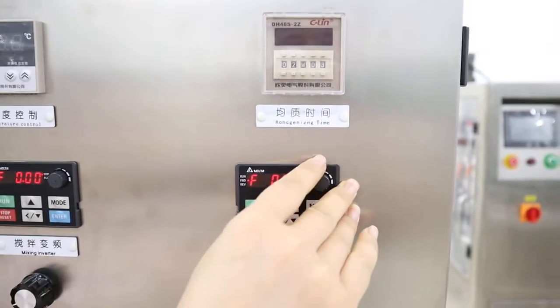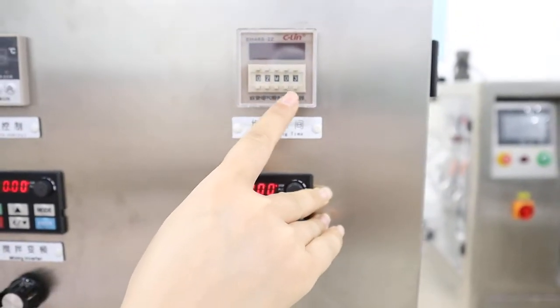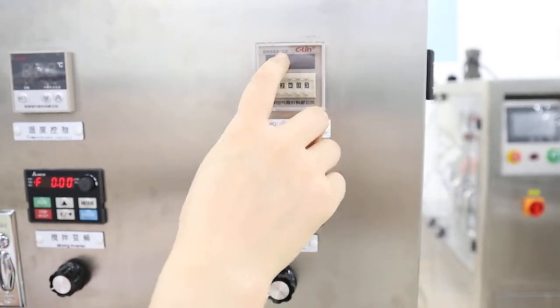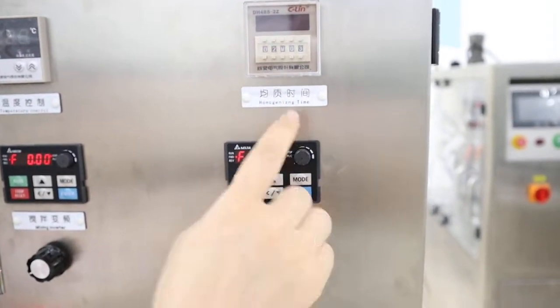Here is the homogenizer timer. You can set how long it will work from here, and when this time meets this time, it will stop homogenizing.